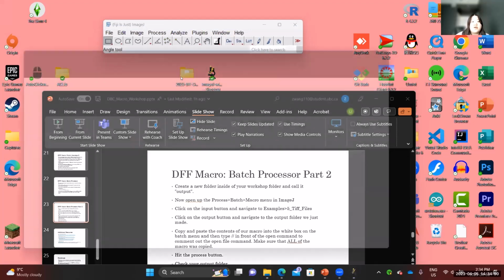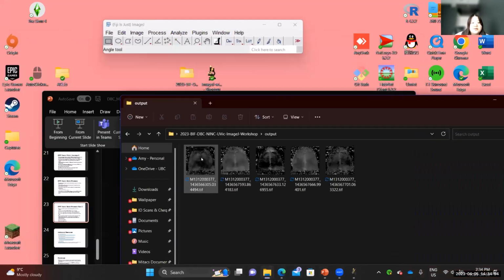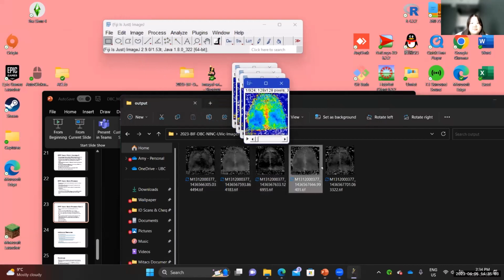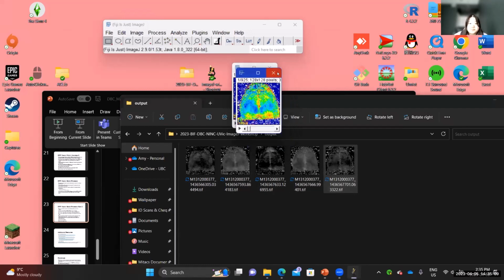And it's done processing all of them. So let's see if it did what we wanted. I'm just going to drag and drop them to double check. All of them are colorful and nice. Okay, great. So the batch processing worked.